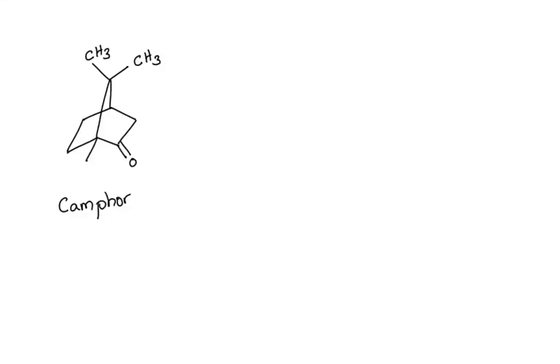This is camphor. It's a white solid and it gives a good pungent smell that is used for treating cold and congestion, right? Like in Vicks. The inhaler has the major ingredient camphor, right? Okay, but in today's lab, we're going to use this camphor to synthesize isoborneol through a reduction reaction.